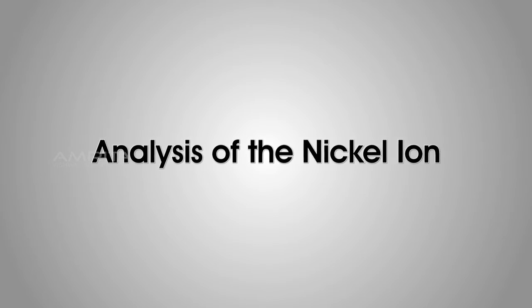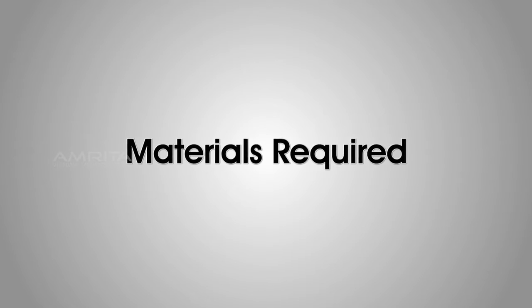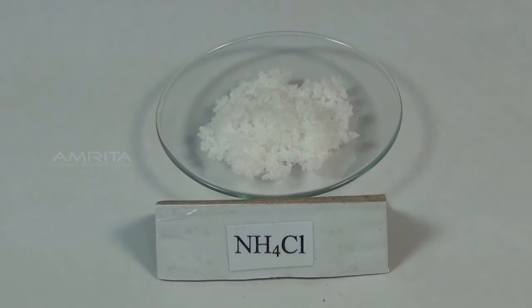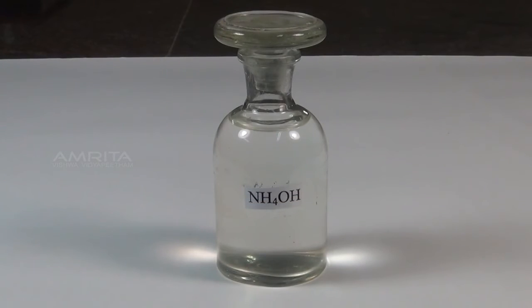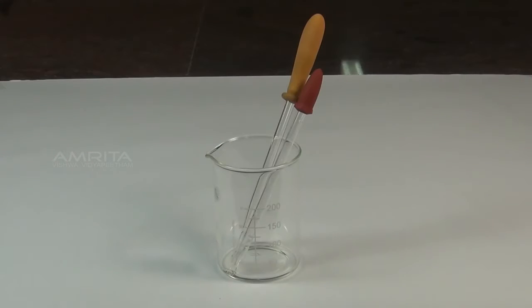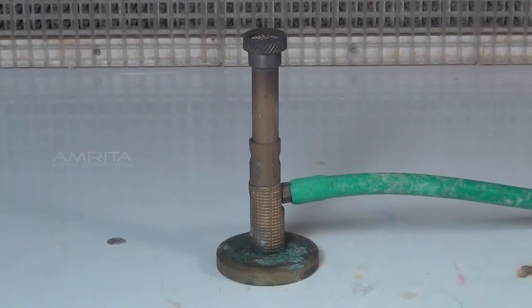Next, we look at the analysis of the nickel ion. Materials required: salt solution in a test tube, concentrated nitric acid, ammonium chloride, ammonium hydroxide, hydrogen sulfide gas, spatula, droppers, test tube holder and Bunsen burner.